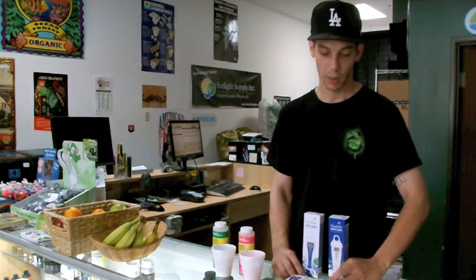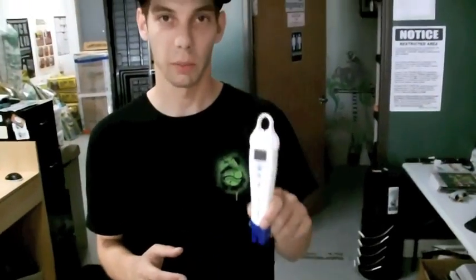Bluelab has come out with a Bluelab pH pen as well as a PPM pen that works separately. I've been using them. All of our customers and friends have loved them. If you take home a Bluelab PPM pen, which reads EC PPM for your water, this is factory calibrated. It's good to go right out of the box — just turn it on, use it, and you're going to have accurate readings immediately.